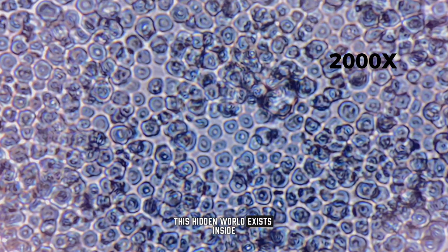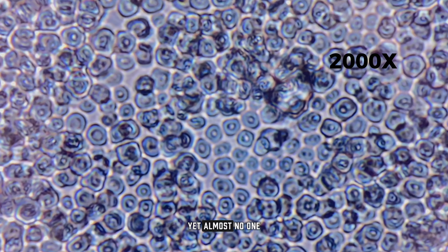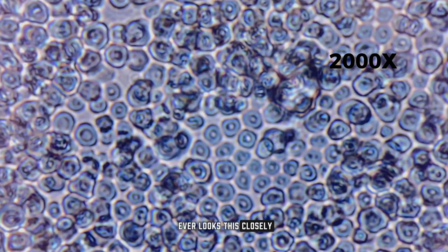This hidden world exists inside something people use every day, yet almost no one ever looks this closely.